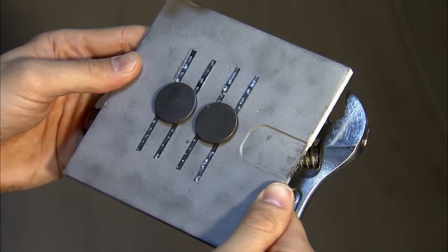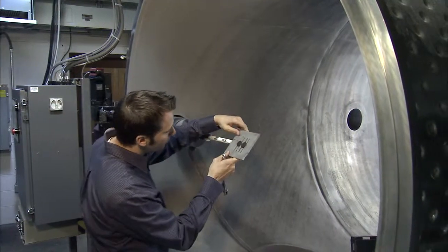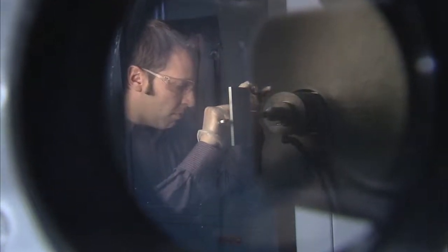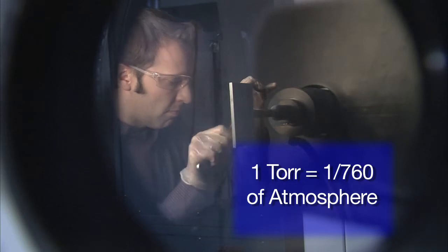During our run process, our samples are mounted to a metallic plate, which is then loaded on our sample mounting arm. The chamber is closed, and the entire system is evacuated to a pressure of 1 torr, which is 1/760th of atmosphere.